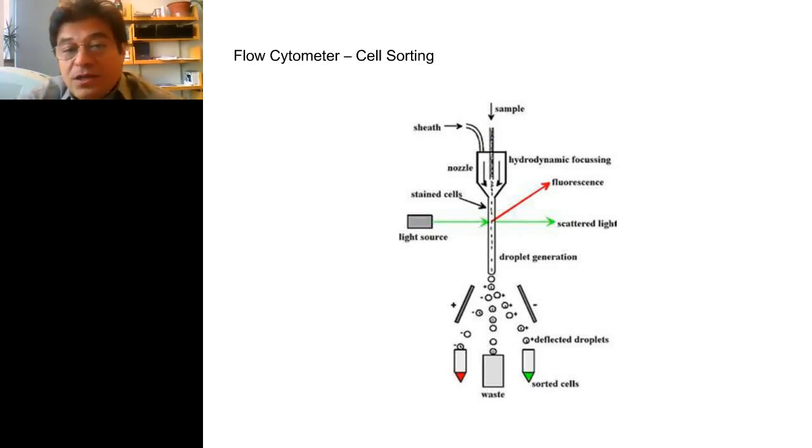And just to get back to the issue with cell sorting, since we work in a cell sorting facility, the issue there is that the machine is in a way a serial machine. It's one cell after the other, and they have to be passed through some sort of a droplet generating system. Now there are other types of cell sorters that are coming down the pike that may challenge some of these longstanding limitations. But let's just focus right now on the more traditional cell sorting unit.